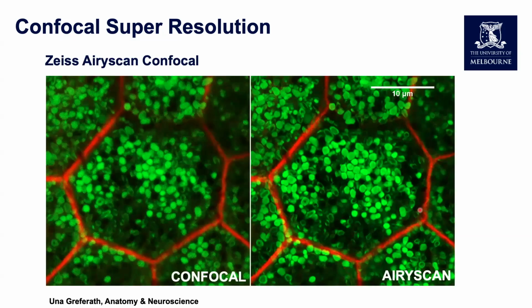In this example data, the same field of view was taken on standard confocal imaging, and then also with the AiryScan detector. And hopefully you can see there's a fairly good resolution improvement between the two data sets.